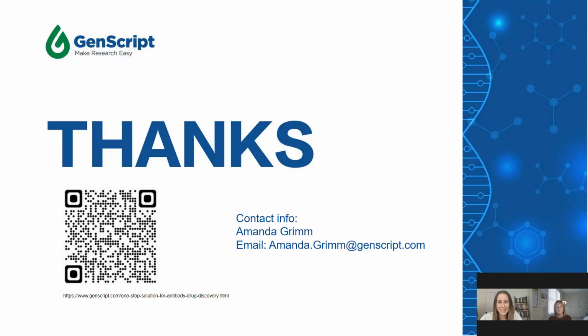Thank you. We'll wrap with this one. How many samples can the AmMag do in a day? So with a normal workday, you could get a minimum of 60 samples, and that's based on putting in 12 samples and the fact that it can complete it in about an hour.